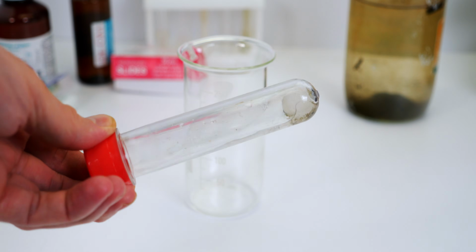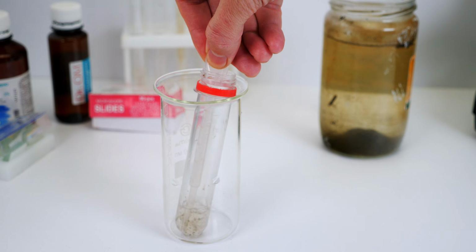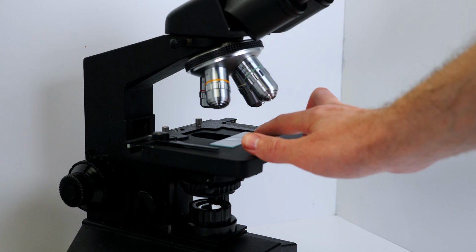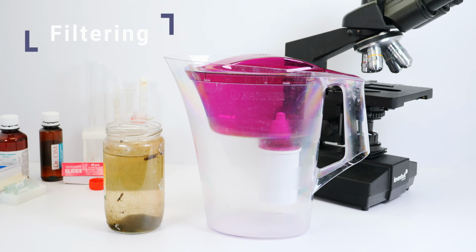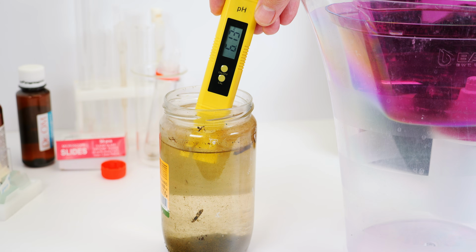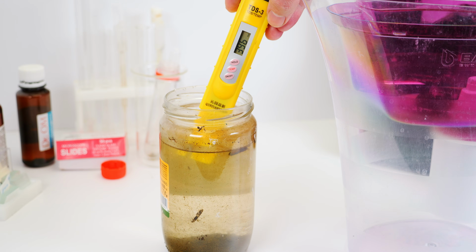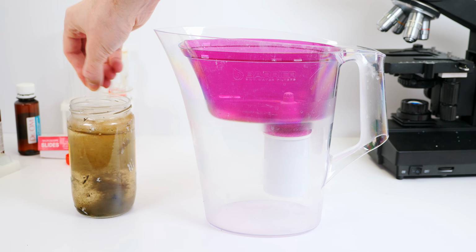I left it out for a couple of hours so it could thaw naturally at room temperature. We take the thawed water with a pipette, place a drop on the slide, and put it under the microscope. But since I know you came here to see the water filtration test, I can't stretch this out any longer. I'll show the thawed water at the end of this video. First, let's check the pH of the dirty water. It came out to 7.13. Then we'll use another device to measure the amount of dissolved solids and impurities in the water. The TDS meter showed 400 parts per million.